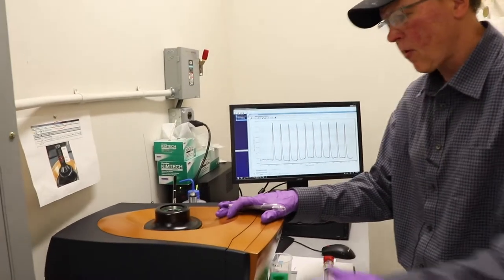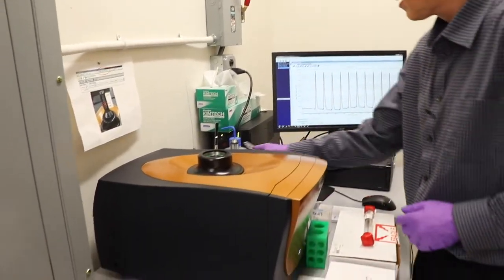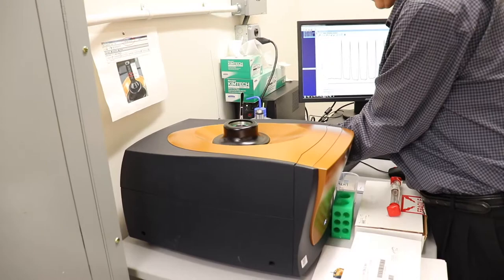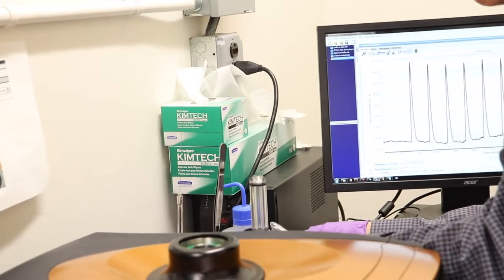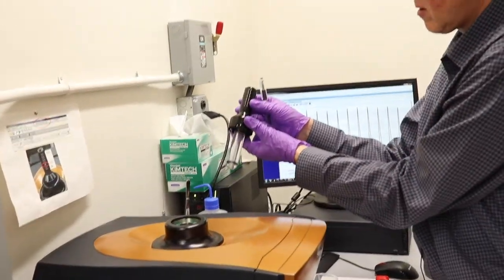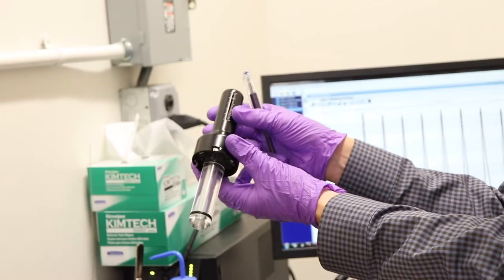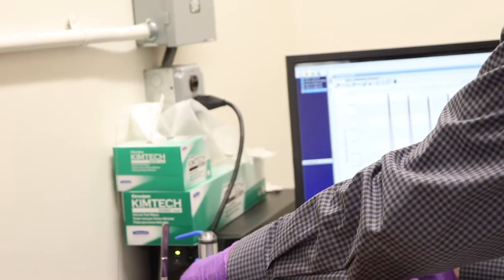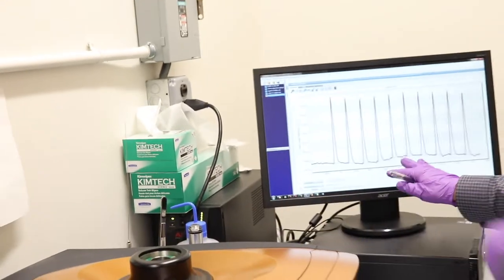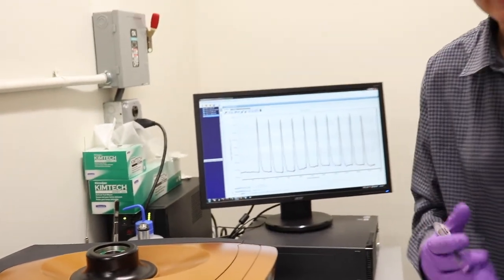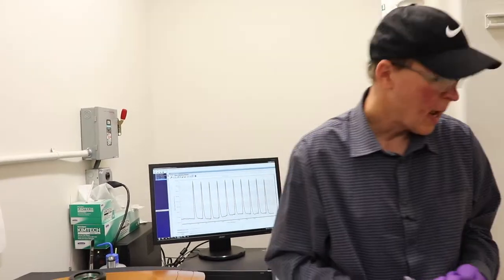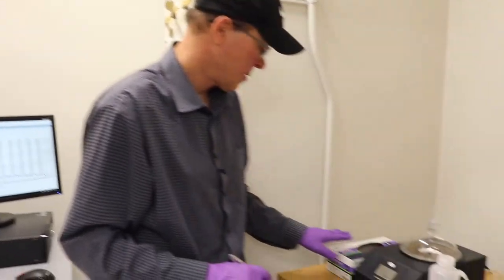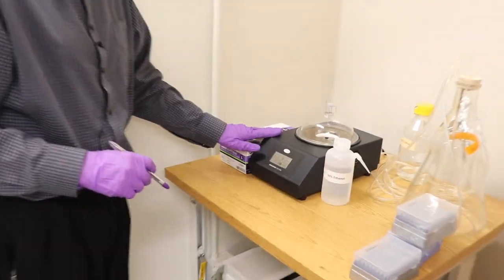So this is our ITC unit here. Back here we have a little tool holder where our syringe and burette holder are stored. This is the burette syringe holder. This is our control computer which you can access remotely for longer experiments so you can monitor them back from your lab. Over here, this is our degasser.